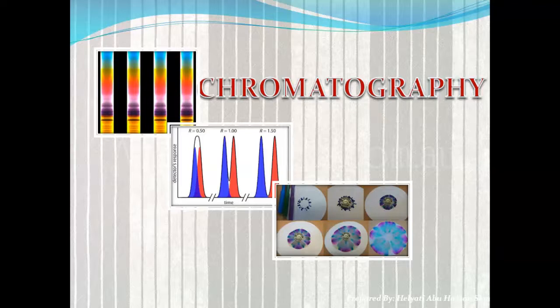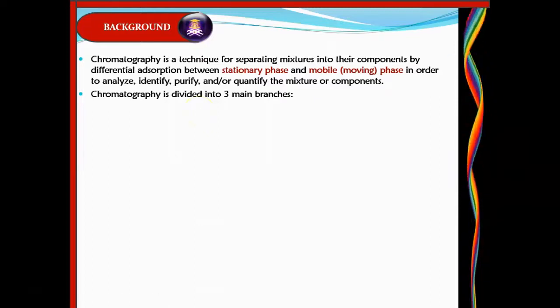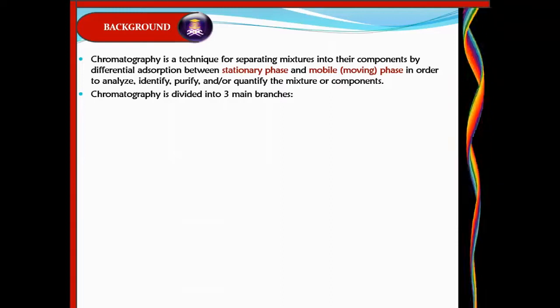Stay safe everyone, and let's look at our first chapter in PSD 351, which is chromatography. For today's lecture we will cover paper chromatography and thin layer chromatography, also known as TLC. So first, I would like to explain the background of chromatography.